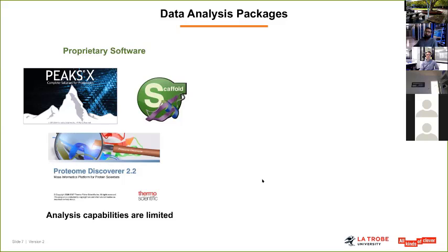So if the method that you're planning to use is not implemented in the software, or the method is not appropriate to your application, we won't be able to use any of this, then we have to think about a different way of doing that. But to overcome such issues, nowadays programs like Proteome Discoverer are incorporating a programmable module, so we can insert some R code or Python code and go around, but still it is very limited.